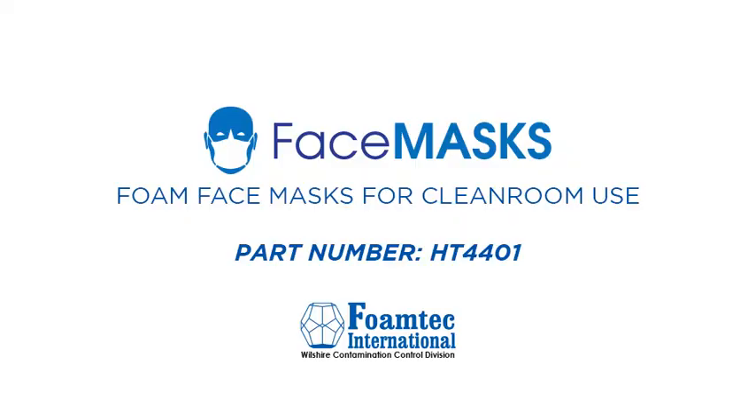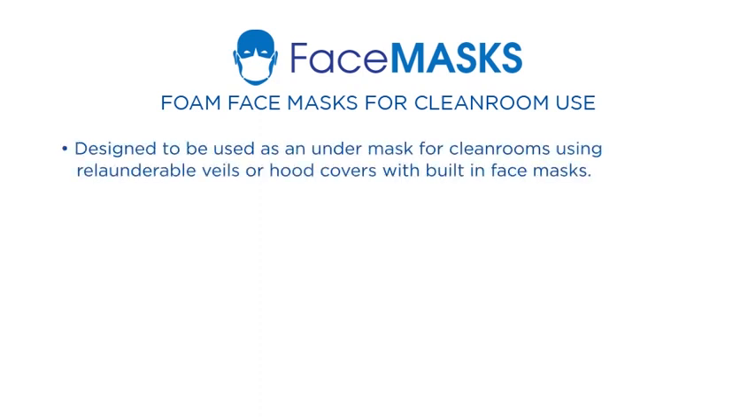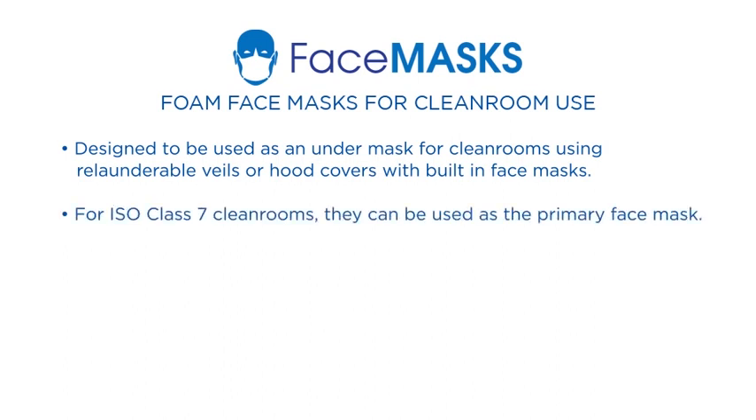To address this issue, Foamtech has developed foam face masks for cleanroom use. They are designed to be used as an under-mask for cleanrooms using re-launderable veils or hood covers with built-in face masks, and can be used as the primary face mask for ISO class 7 cleanrooms and above.